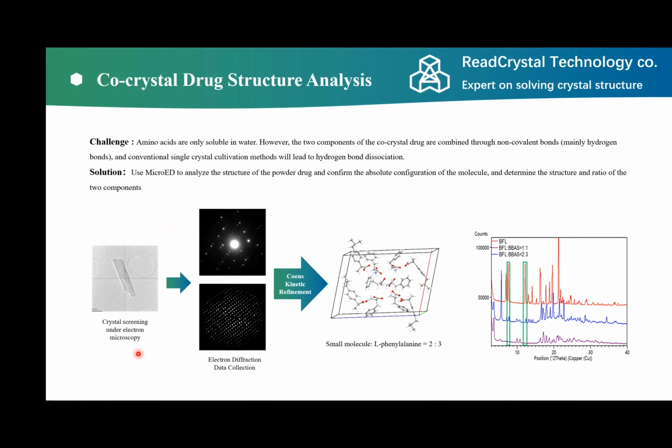So there is a very limited selection of solvents for you, and the structure of the co-crystal is quite crucial, because only with the structure do you get information that those 2 ingredients are actually crystallized together rather than two of them crystallized separately and mixed physically. This information is also important for the drug to be approved by the authority.